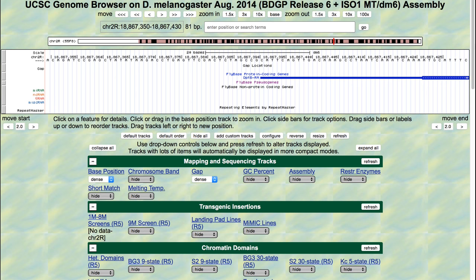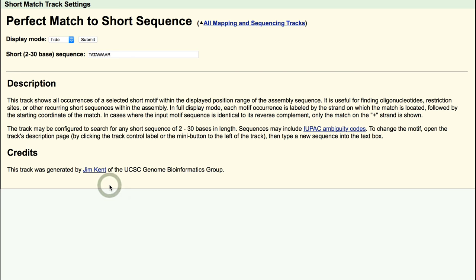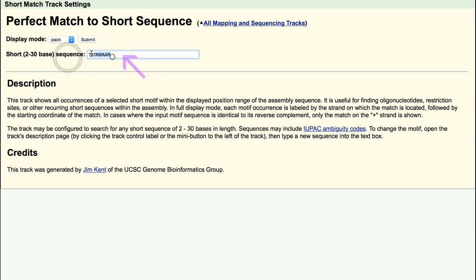The consensus sequence for the INR motif in Drosophila is six bases long, running in the same orientation as the gene. To use Short Match, locate the mapping and sequencing track section within the genome browser and click on the Short Match link. Change the display mode field to Pack and type TCAKTY into the short 2-30 base sequence field. Note that TCAKTY is the consensus sequence for the INR in Drosophila. K represents Keto — either guanine or thymine — and Y represents pyrimidine — either cytosine or thymine.